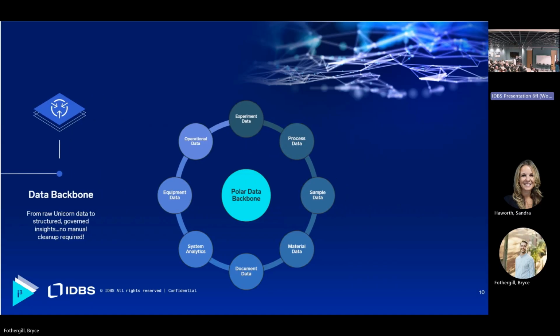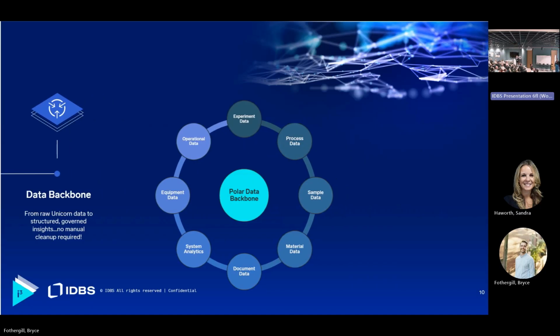Thank you, Kayla. And yeah, that's so ugly. But we're going to go to stop 2 on our road trip, which is the data backbone. So as Kayla mentioned, there's a lot of data within Unicorn that we are grabbing via the OPC connector into the integration and going right into our data backbone.